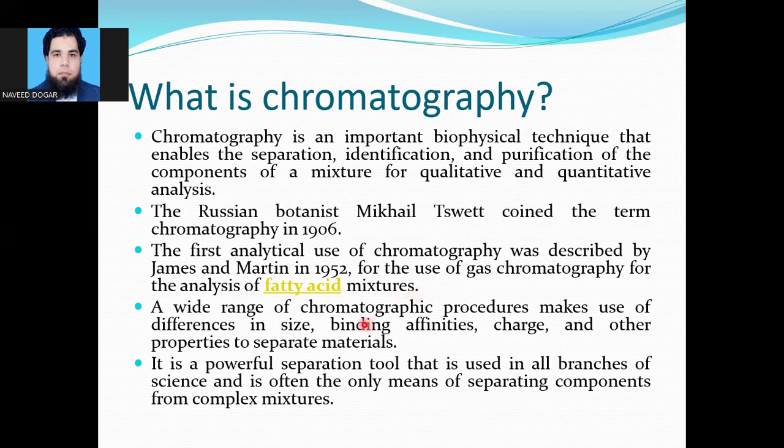In fact, chromatography is a very powerful separation technique, and it is used in all branches of science. When we have to separate the components of a mixture, the most preferable technique is chromatography.